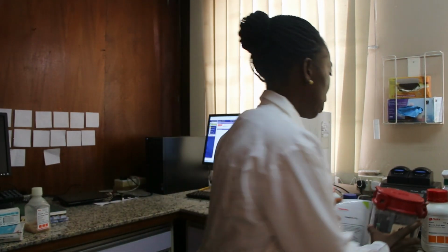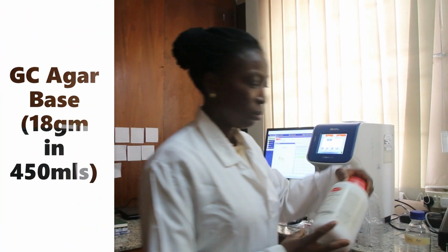The microaerophilic condition is required by H. pylori in order to grow optimally. Apart from this, H. pylori is also fastidious, meaning that it requires rich nutrients, and this can be provided by the use of a very rich agar base like Columbia agar, GC agar, and Brucella agar. But here in Professor Stella's laboratory, we use GC agar.